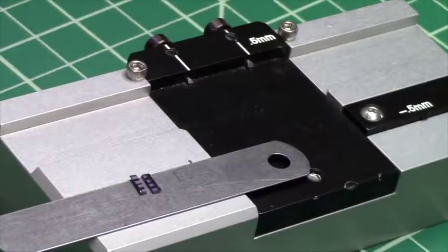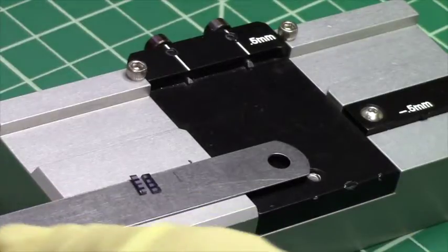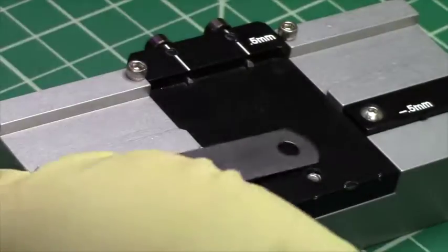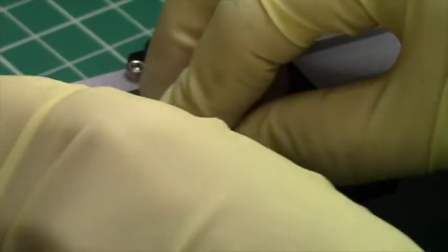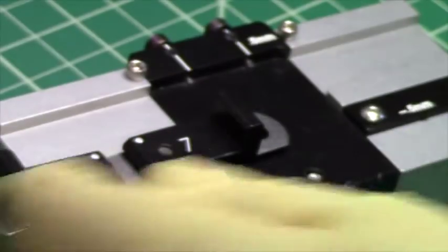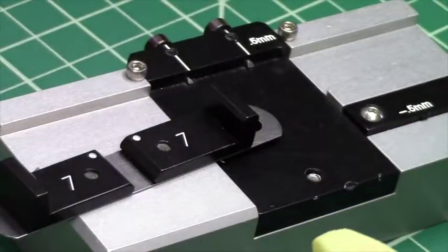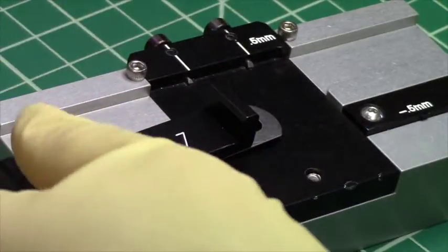By doing so, we don't have to touch the surface of the sample with our fingers, and we're able to secure it with the hold down provided in the small sample cleaving kit. Your kit comes with four hold downs for anything from about 250 to 950 microns thick.